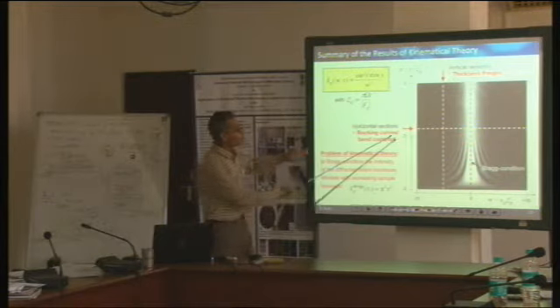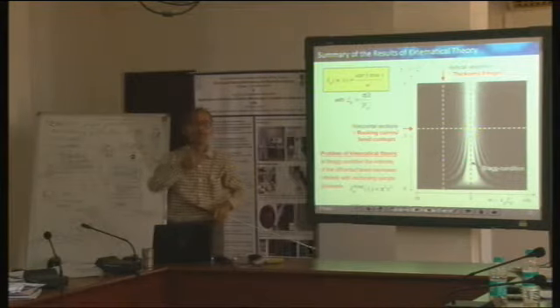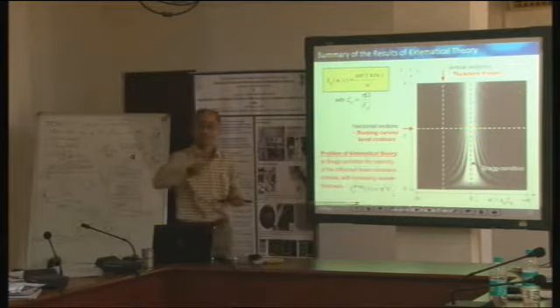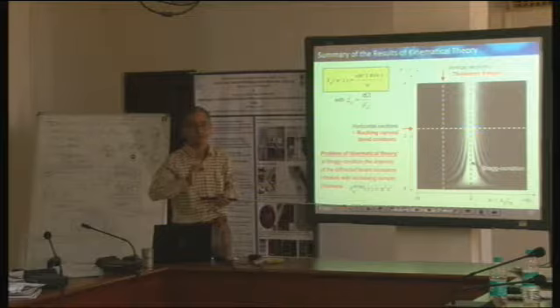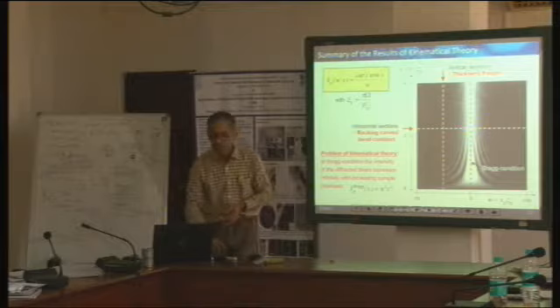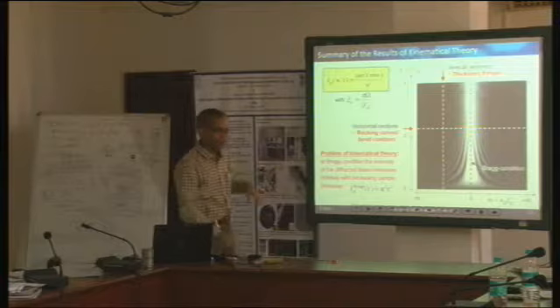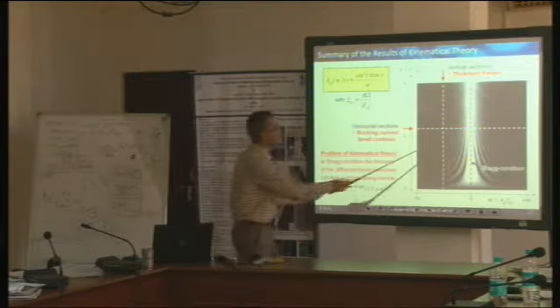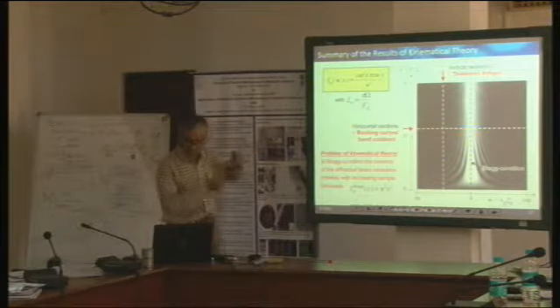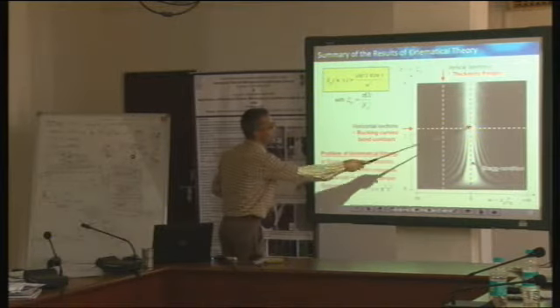Here we keep the thickness constant, but we change how far the sample is bent. So at this point, it is satisfying the Bragg diffraction condition perfectly, and there it shows maximum intensity. As we go away from it, the intensity decreases, but there is still a fringe pattern. I mean, there are secondary maxima there also. So we again get a fringe pattern. Now we probably go to the next slide, which will be an example of this case.